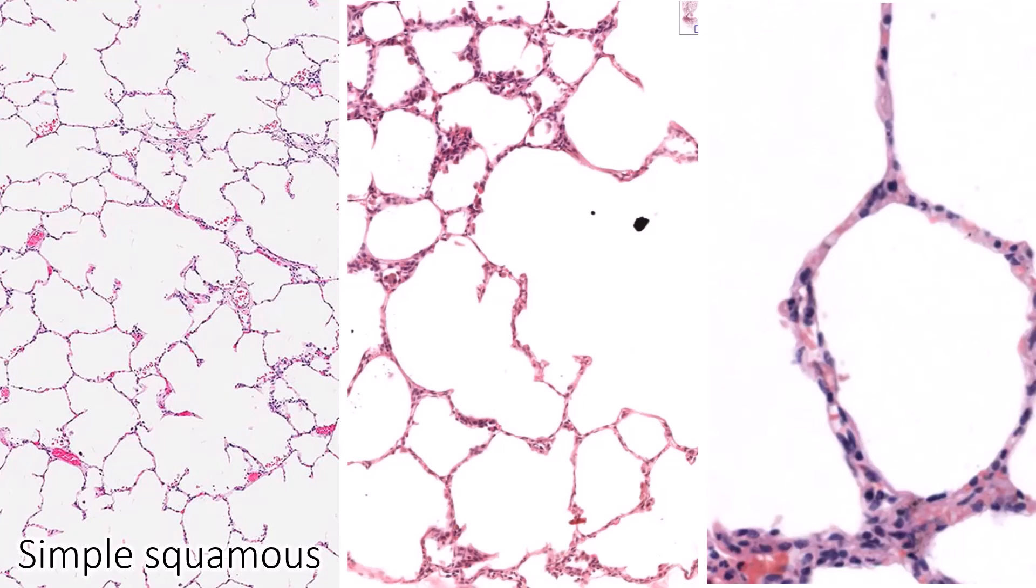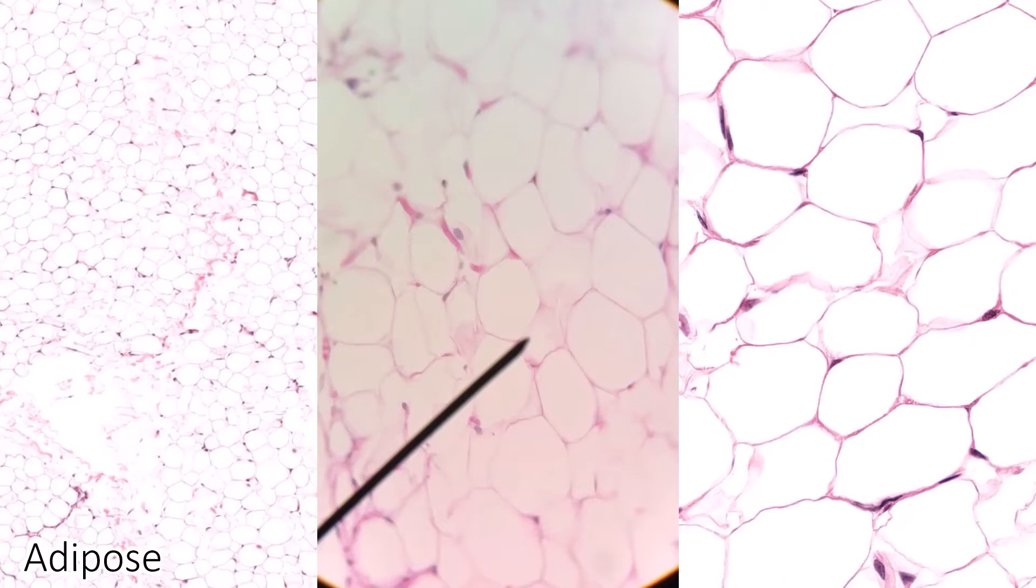These three examples here are typically when people are going to confuse simple squamous for adipose. So this is simple squamous as seen in the lung, and people see empty space and they confuse it with adipose.